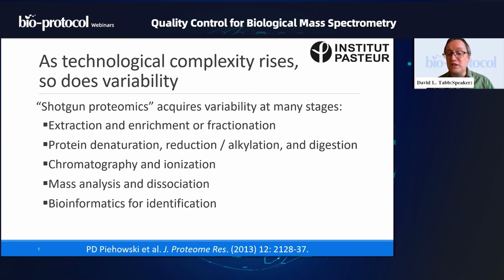The way in which you do protein denaturation may have some effects. Reduction and alkylation can be quite variable. Sometimes people use just a little bit too much dithiothreitol, or DTT, and this causes the peptides to get labeled in ways they didn't expect. Or maybe they handled the digestion differently. Maybe in the one case, someone started the digestion process, went home, slept, woke up, and came in the next morning. And maybe in the next case, they started it when they arrived at the lab, and they stopped it when they finished their day at the lab. These are very different time intervals.